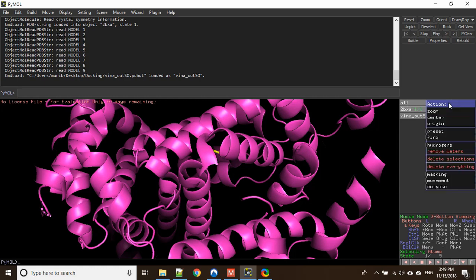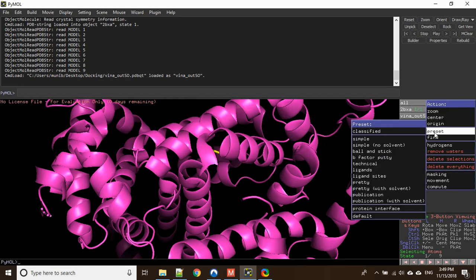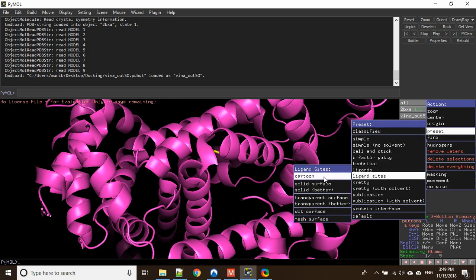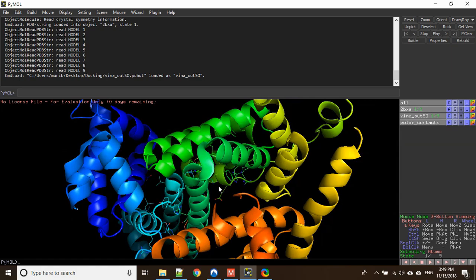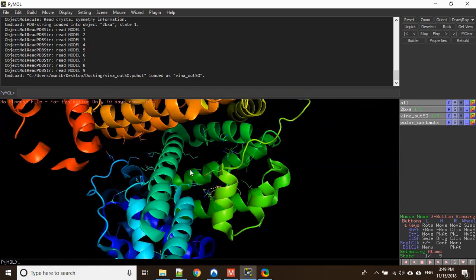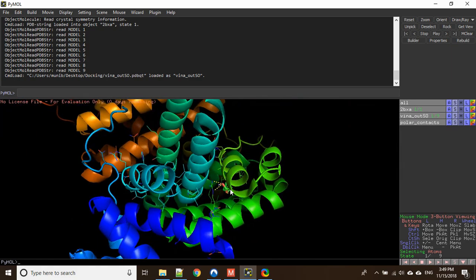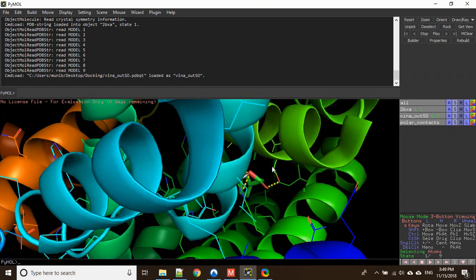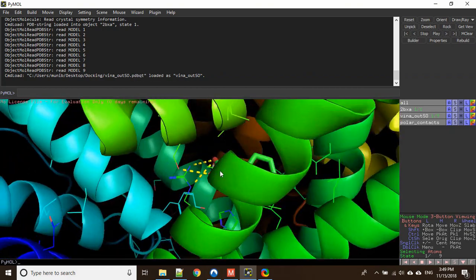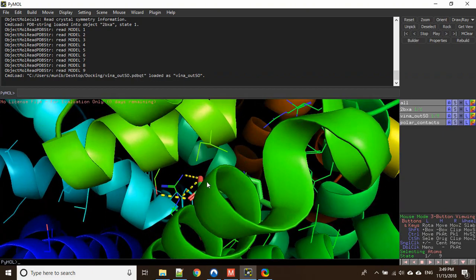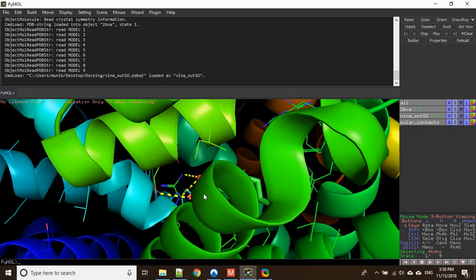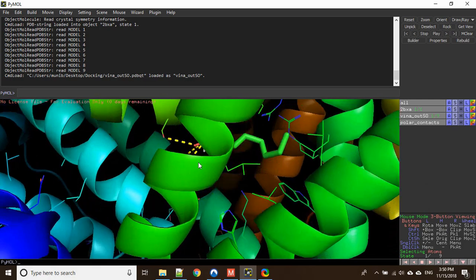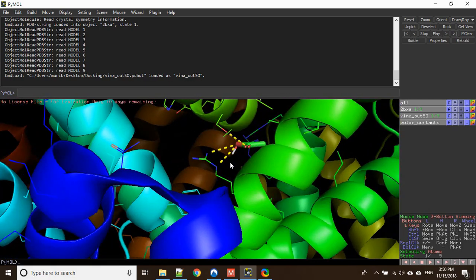So we need to go to the Action tab, click on that, and go to Preset > Ligand Sites, and set it to cartoon. As you can see, the appearance has been changed. Here is our ligand and these are three polar bonds which it is showing — this is the interaction with our amino acid residues.